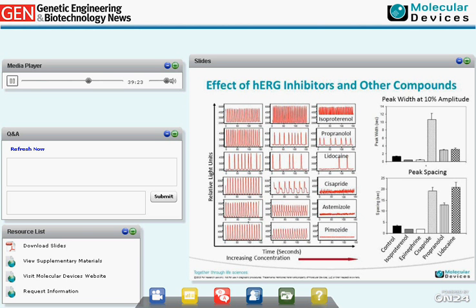So now by looking at these multiple parameters, we can start characterizing the different types of effects of compounds and mechanism of actions. And as we are doing more work on this, the question becomes, is this a predictive assay, or can this be a predictive assay?